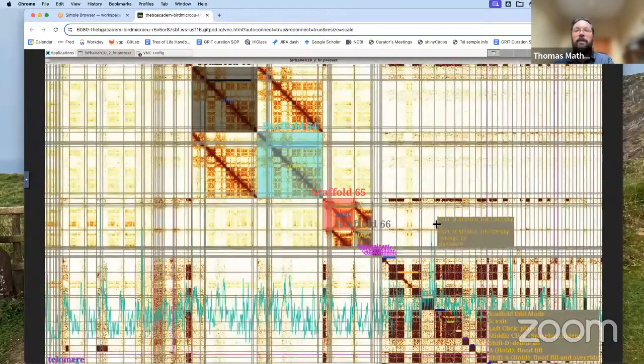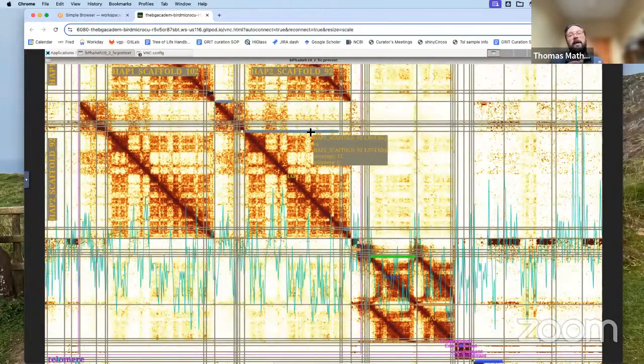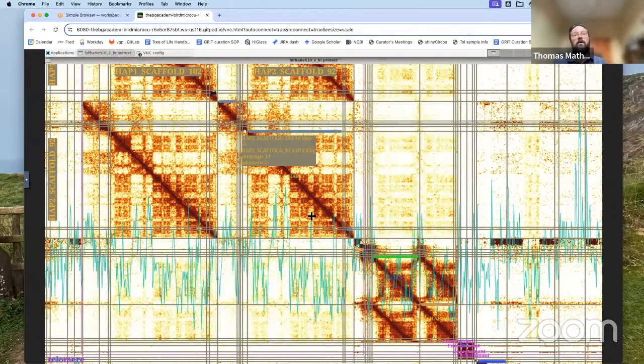These are some examples of the smaller chromosomes at the end, which are our micros. This is where I would say that looks pretty decent for what we can do at this scale of map. We've got the smallest ones down here. This is very small.